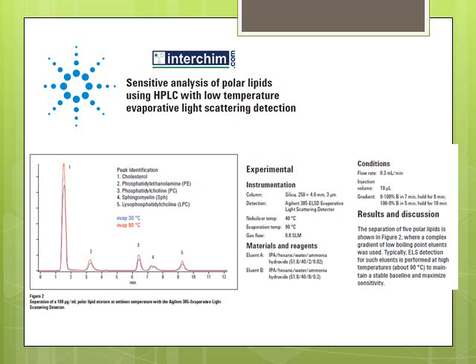I did not get proper specificity with this method, and I had my excipients in the formulation correlating with the PC, or peak of interest. So most of the time I did not have the desirable chromatography that I was looking for. But this is one method that people may want to try.